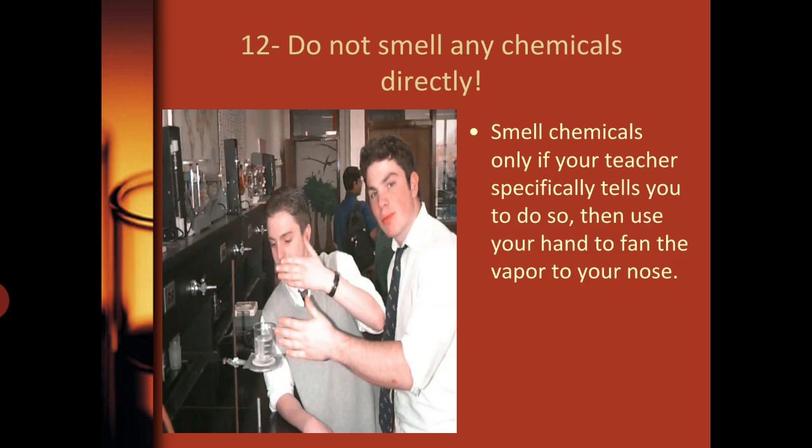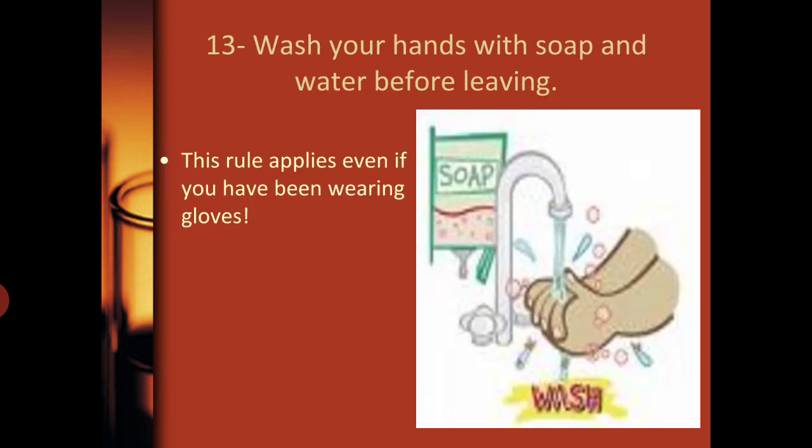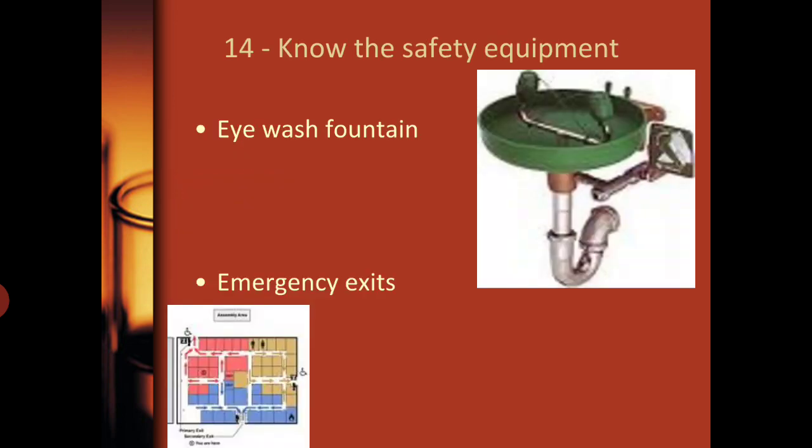If your teacher asks you to smell any of the chemicals, use your hands to fan the vapor to your nose. Wash your hands with soap and water before leaving, and this rule applies even for those who are wearing gloves. So remove your gloves and wash your hands before you leave the lab, and know where the safety equipments are placed in your laboratory or in the place where you will be working.